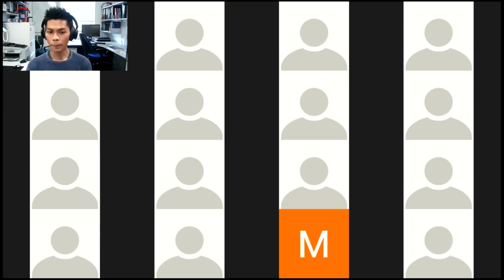You might need to use your cursor to back up a little bit. Do a dash O. Again, the difference is a flag begins with a dash or a hyphen. That now should work better. There we go. Thank you. Yep, no worries. Whereby tilde is specifically a shortcut for the home directory. So that should be an error in terms of, it shouldn't be interpreted at all. But if it does, then there might be some bug in the code.